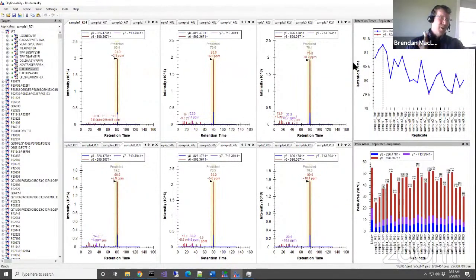So we're going to put this data set aside and move on to the next data set, and then we'll come back and look at it again, maybe with MS stats, and Mina can tell us how to analyze the MS stats results. If all we want is a first look at these data, we don't need to do any other point by point looking. We feel pretty good about how this was processed. So I'm done with that data set. I guess I just click new.